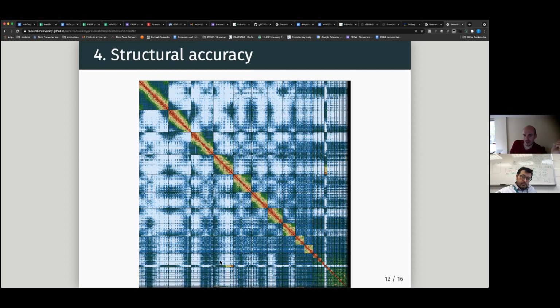Here, for instance, you can see a problem where there is a small chunk that contains a signal connecting it to chromosome 4, let's say. This chunk, which is probably a subtelomeric region of the chromosome, was not assembled correctly, and it was left alone and not integrated into the chromosome.